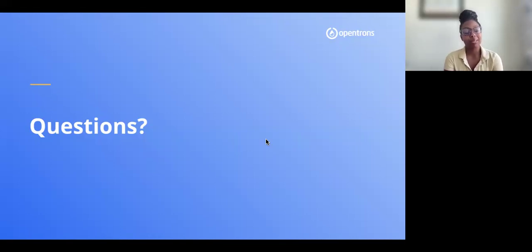Yeah, absolutely, it's a great question. For the library prep on the OT-2, our average throughput was closer to 24 samples. That was our sweet spot, benchmarking that against standard NGS. The thing that's really notable about the OT-2 is there was no gripper functionality. So we were able to do that either by pipetting the samples from module to module from our magnetic module, or by implementing a pause step to actually move the plate from the thermocycler to the other modules.